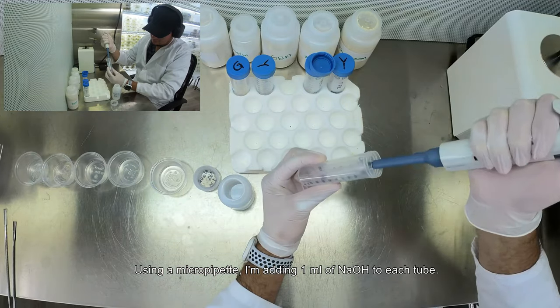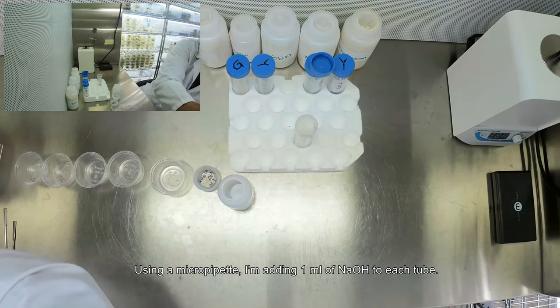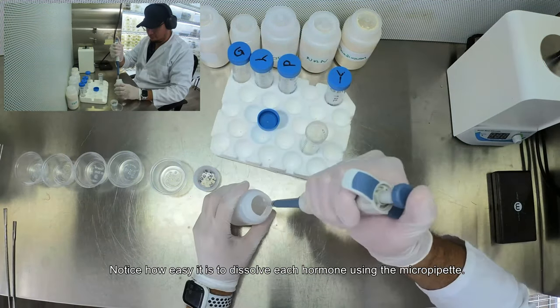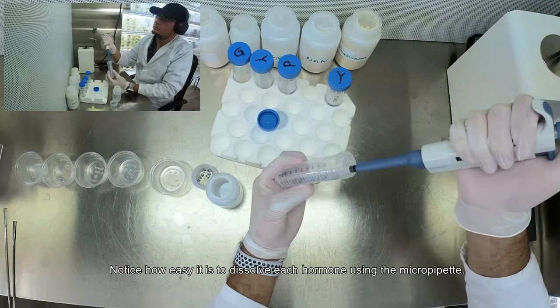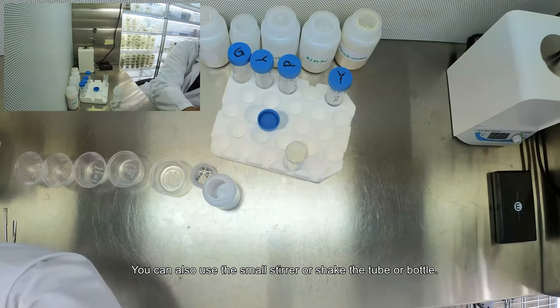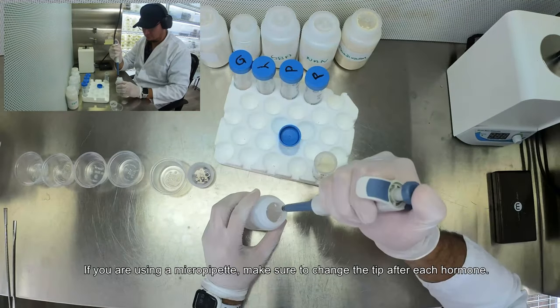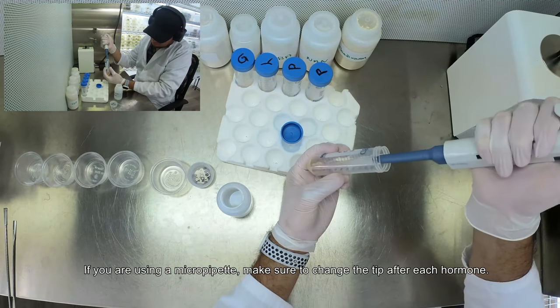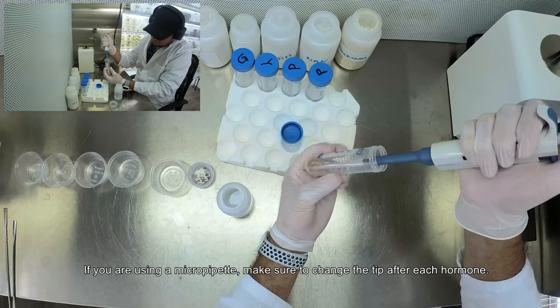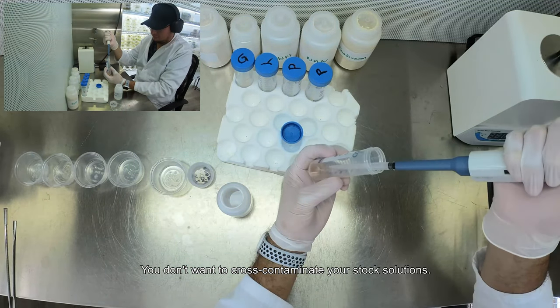Using a micropipette and adding 1 ml of sodium hydroxide to each tube. Notice how easy it is to dissolve each hormone using the micropipette. You can also use a small stirrer or shake the tube or bottle. If you are using a micropipette, make sure to change the tip after each hormone. You don't want to cross-contaminate your stock solutions.